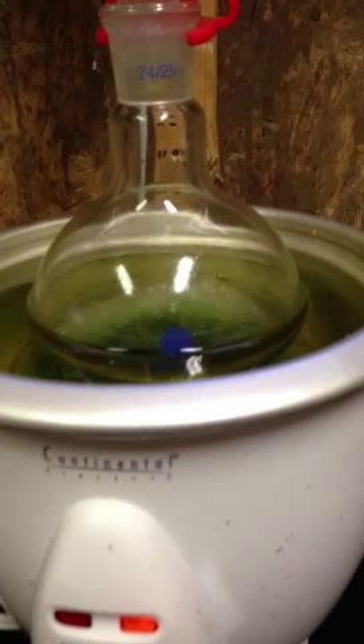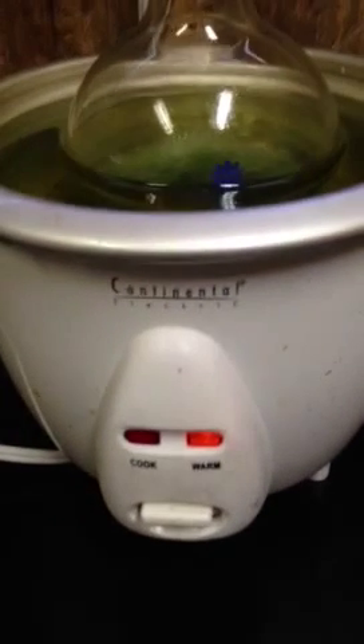I'm using methanol, or wood alcohol, as a solvent right now. You put plain solvent, fresh solvent, in the bottom here — the boiling flask. I'm using it in an oil bath of a rice cooker here.